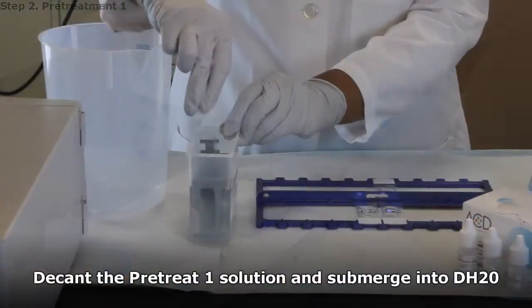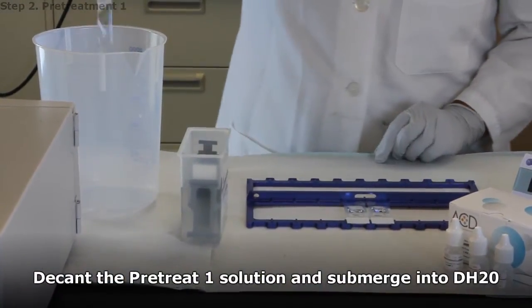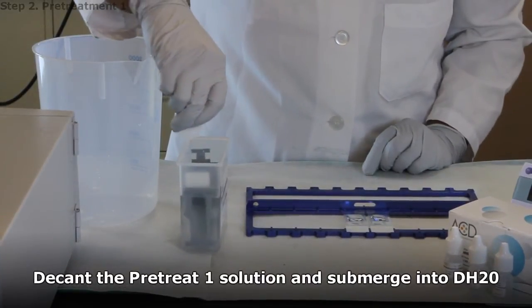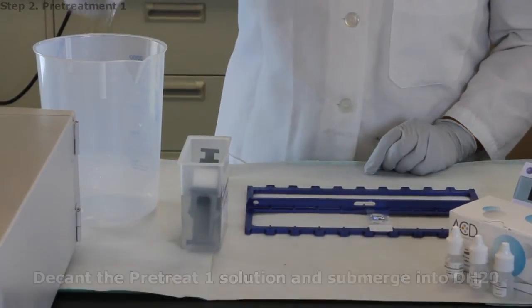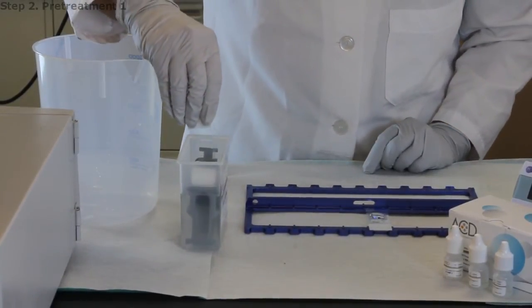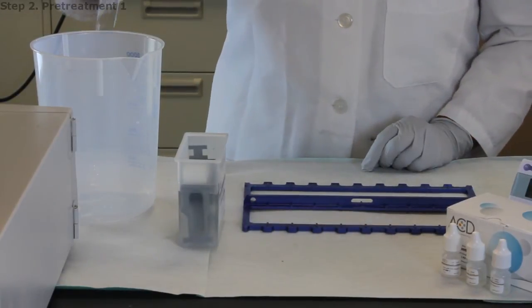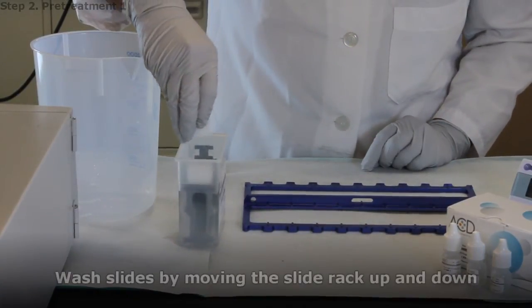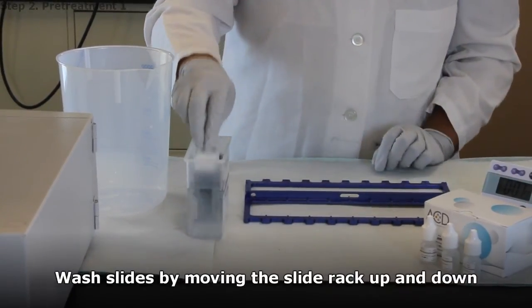Decant the Pre-Treat 1 solution into a waste container and immediately insert the slide into the staining dish containing water. Wash slides by moving the slide rack up and down several times.